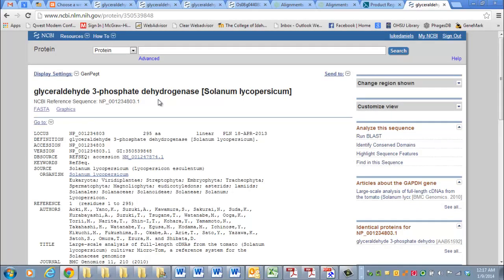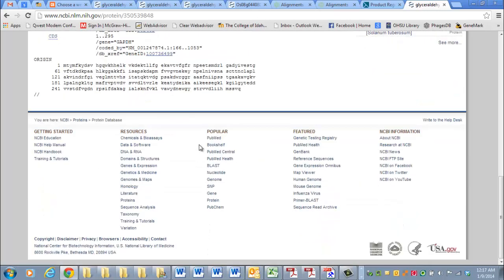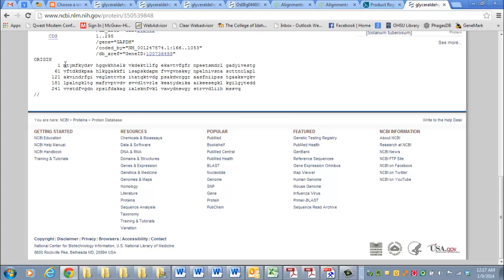GAPDH from our tomato. And now you can scroll down and see the amino acid sequence here of the predicted protein, starting with the methionine, that start codon. So this is the protein.